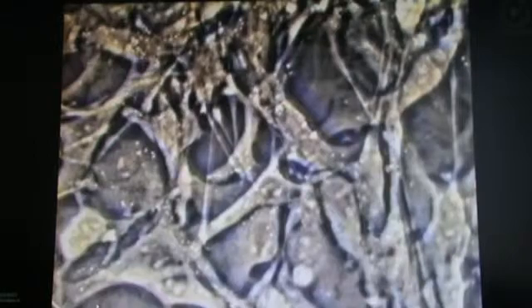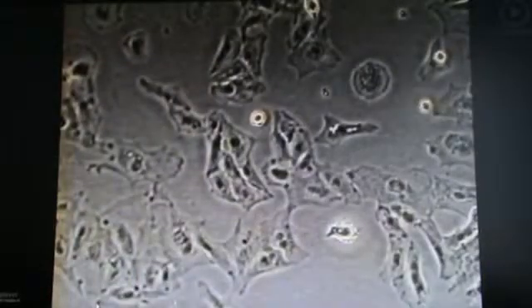Another tissue sample in normal bright field illumination only allows you to observe faint tissue structures. With the Ergonome 500 microscope, using grey field illumination, all the structures can be seen clearly with good image depth right up into the foreground.